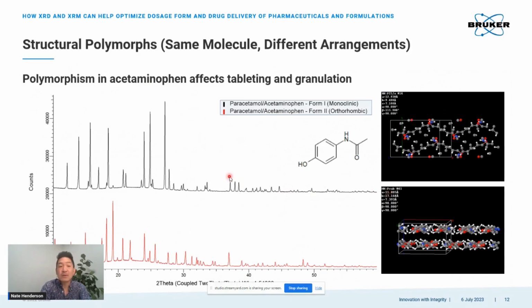Things that could also be different are things like polymorphs. So we're here looking at 2 different forms of paracetamol, same molecule, right? But in the case of a diffraction experiment, we're sensitive to not just the molecule itself, but how this molecule arranges in 3-dimensional space. So here we see this wave packing structure. Here we see more of a sheety or a platy arrangement of the molecules.